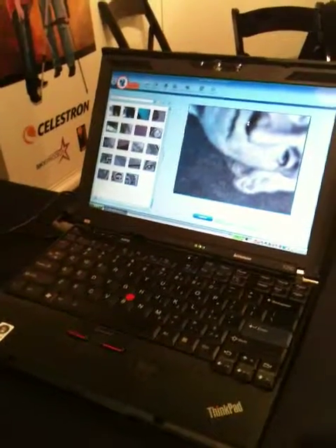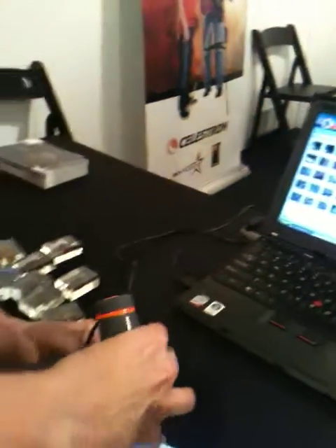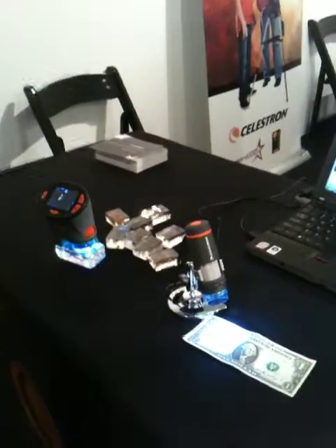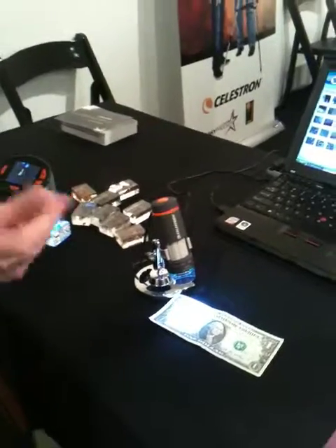So you can do micro photography. Multiple uses — you can take it out in the field with you. Forensics, hobbyists, stamp collecting, rock collecting. Retails for $79.